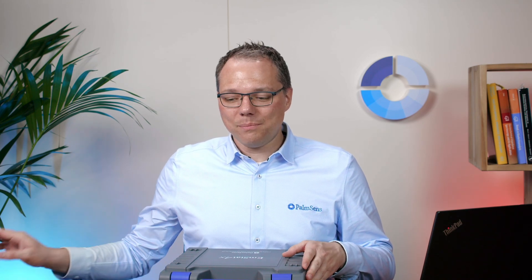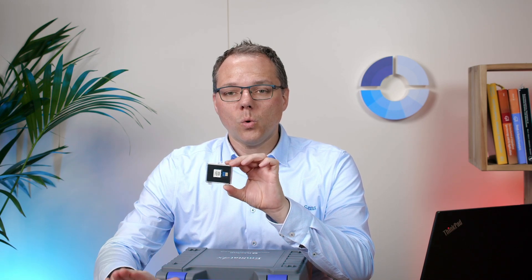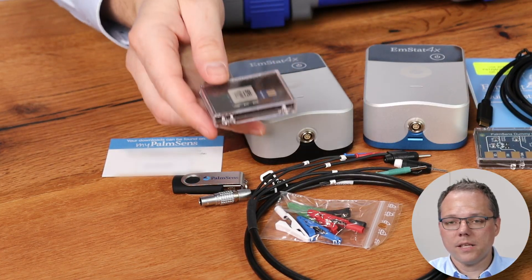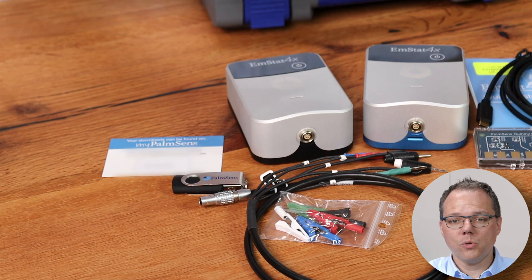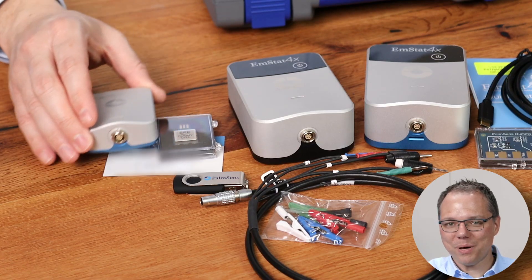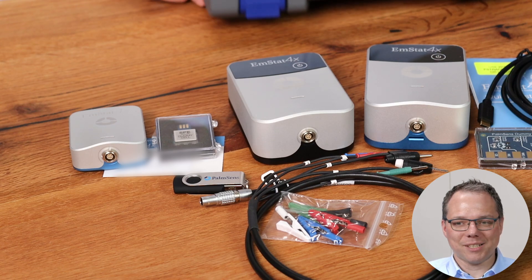Now we have unboxed our EmStat 4X. I would also like to point out the second dummy cell that you will get if you order an EmStat 4LR, because it has the screen printed electrode connector, so you get a dummy cell that matches that as well. For those who are already fans of the EmStat 4S, here is a size comparison between the EmStat 4X and the EmStat 4S. Now let's have a look at our first measurement with the EmStat 4X.